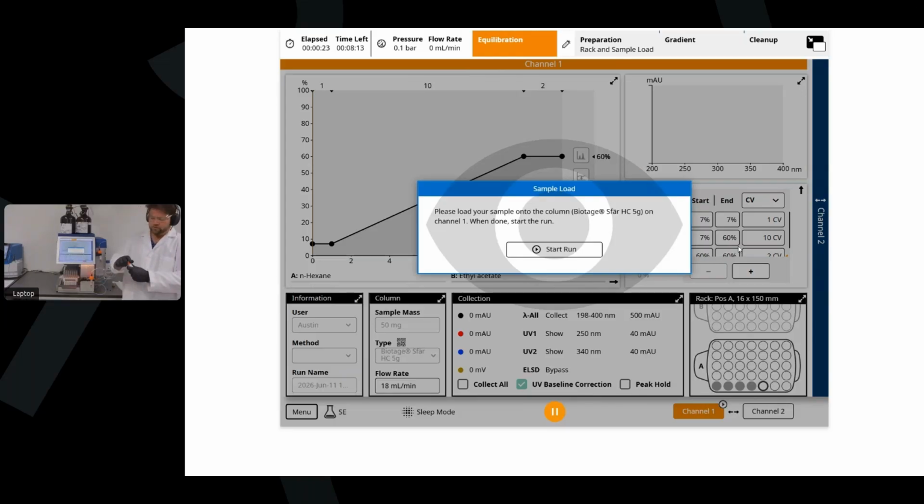All I would have to do is take the top off. These are designed to be unscrewed. I can pop out the diffuser if I wanted to use it for liquid loading, and all we have on the inside is just a simple frit. So I can liquid load directly onto that frit. If I have my compound as a solid, or mixed around with some dry load media, I can always sprinkle that on top, load it and repack the column.